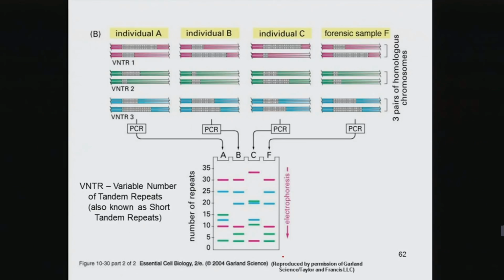So you can design your primers that are specific to these sequences in these variable regions, and then amplify that particular product, run those samples on a gel from these 3 different chromosomes, and the different colors represent the 3 different variable regions, and compare them against other samples. Typically, if the sample is the same, you have the same type of fragments being generated.